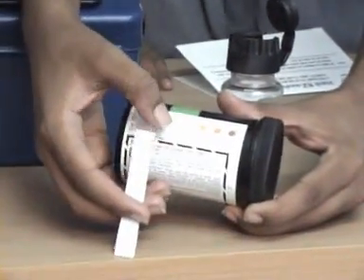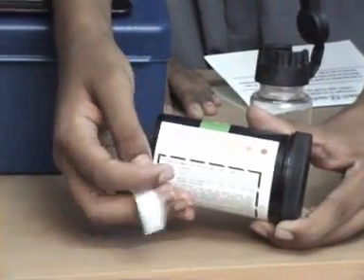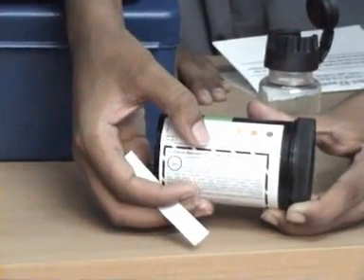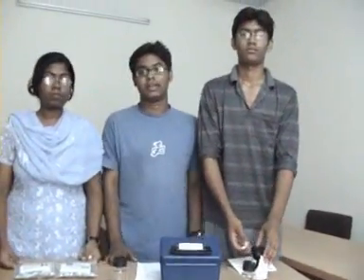After 25 minutes, we opened the cork and checked the color of the strip. We got the strips colored somewhere in the shade from yellow to orange, which indicates 50 ppb to 100 ppb of arsenic present in the water, which is too high to drink. So we suggested people around us not to use that water. Thank you.